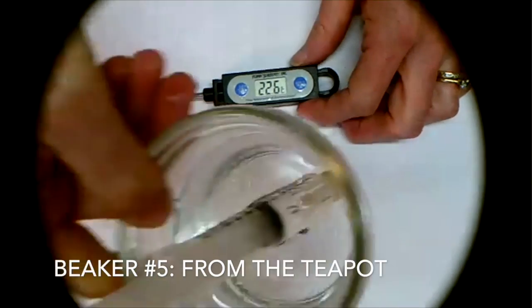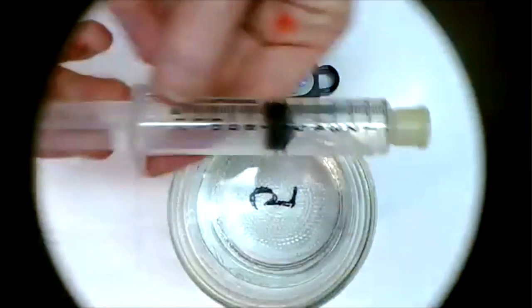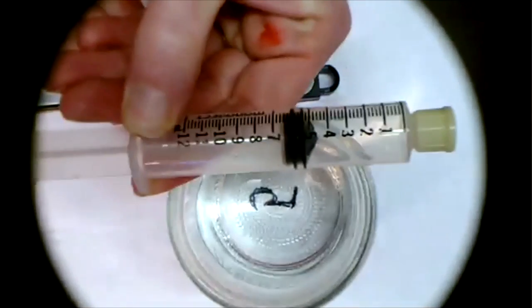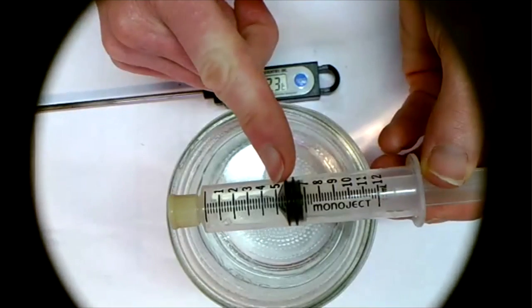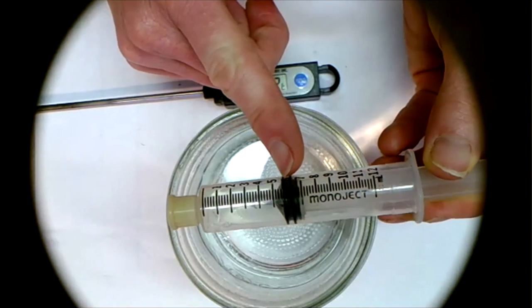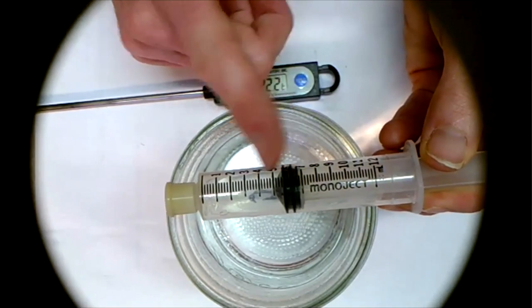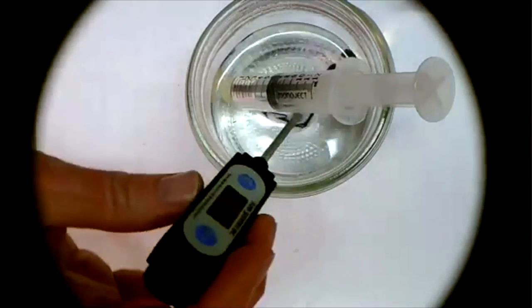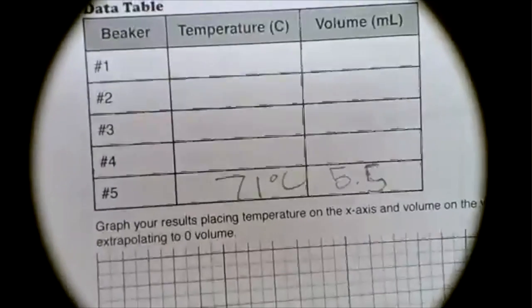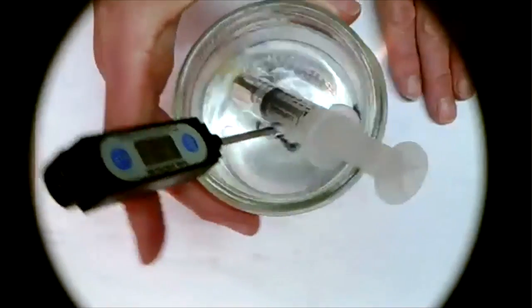So we're actually going to go backwards. This is a really hot one. So this is the hot one that we did, and I'm going to push it a little bit and then let it release just so it doesn't get stuck. But here's the 5, and then if you count up, it's about 5.5. So 5.5 milliliters is for number 5. And this is for a temperature, so 71. Obviously we had a little expansion going on because of the hot water.